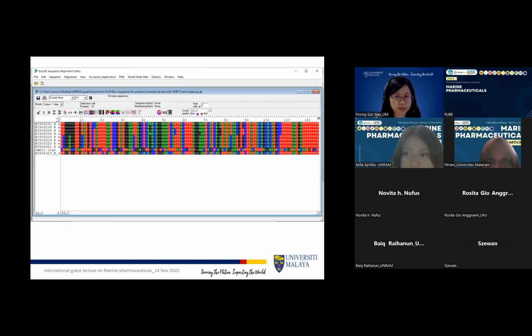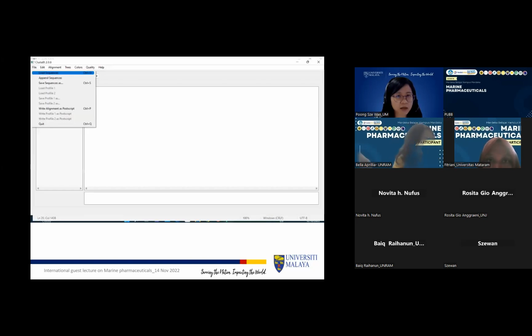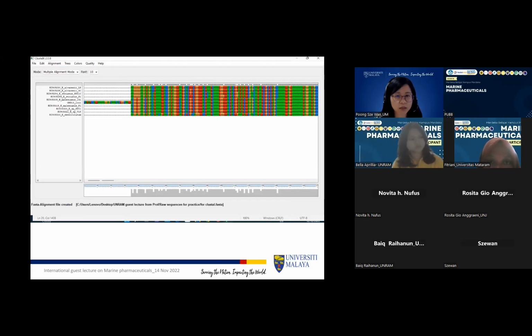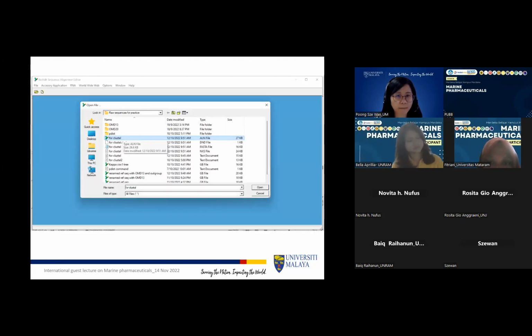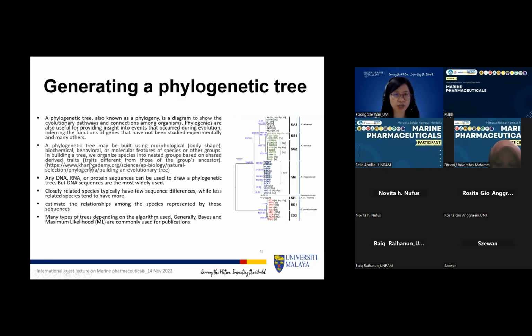So we have done this. I have showed. All right, so we will generate a phylogenetic tree next.